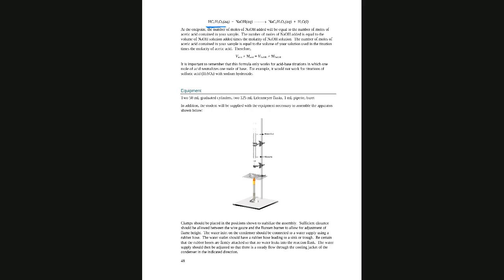And then you take 1 ml and you titrate with sodium hydroxide. And then you are going to do the reaction, and it takes a long time, an hour and a half. We are going to go over that, and then you wait until the reaction reaches equilibrium, and you are going to titrate again, and you're going to obtain the concentration of acetic acid at equilibrium.